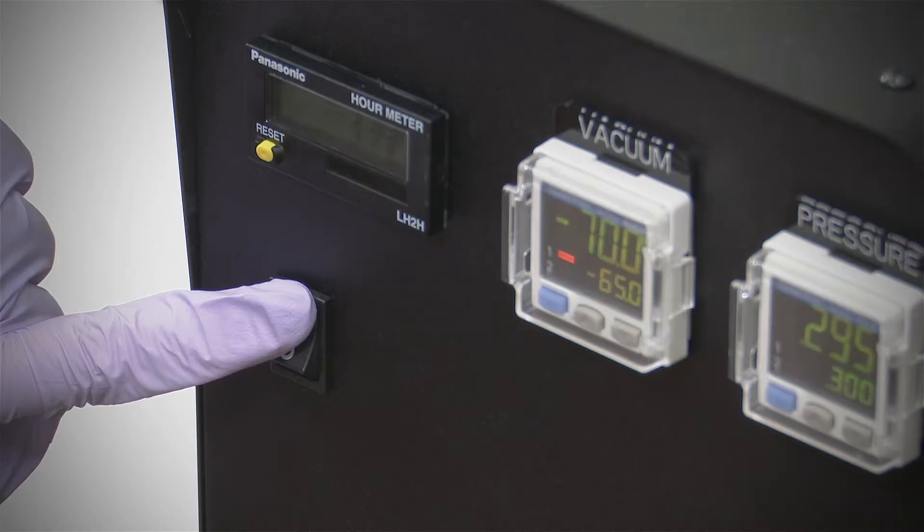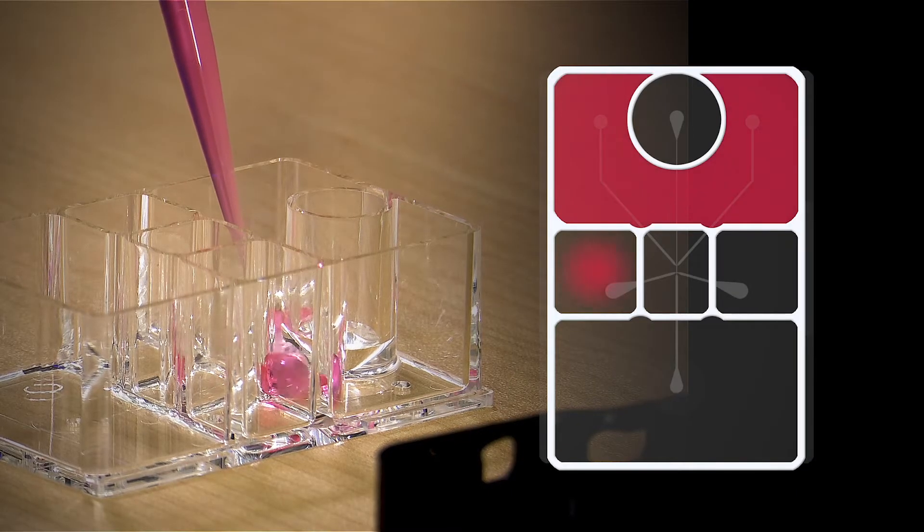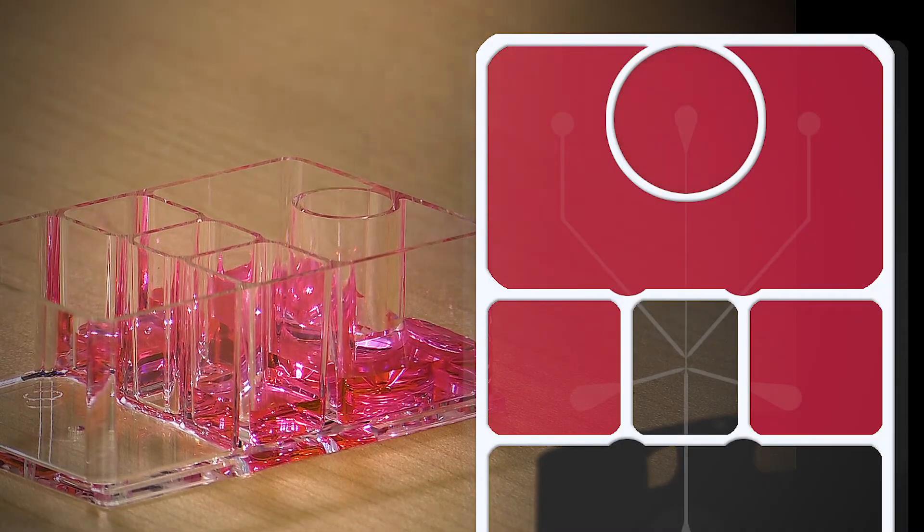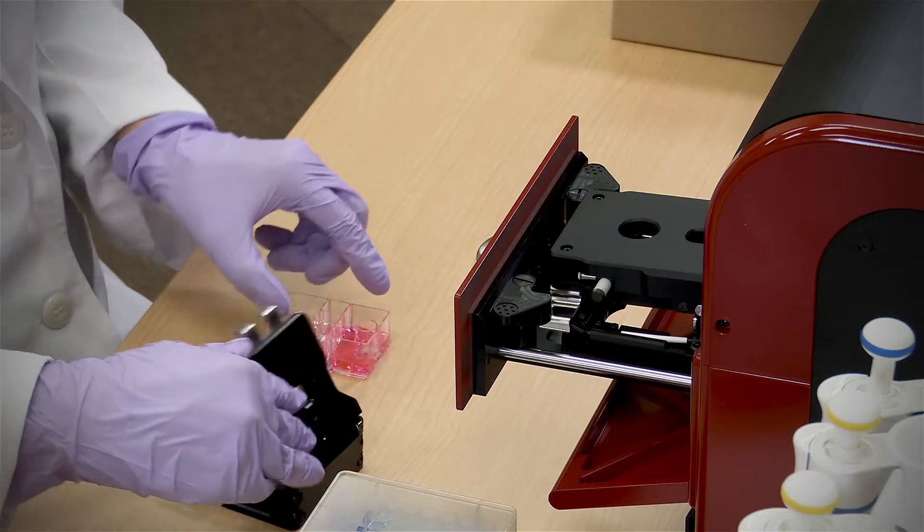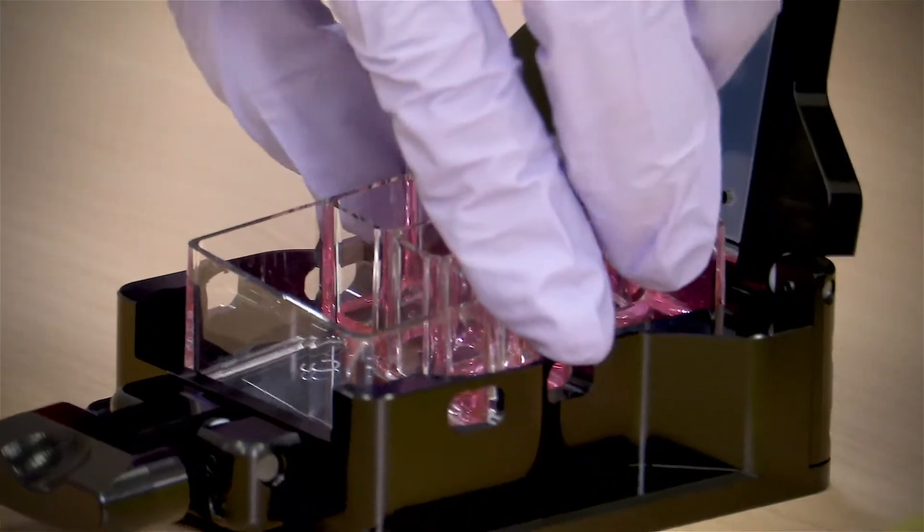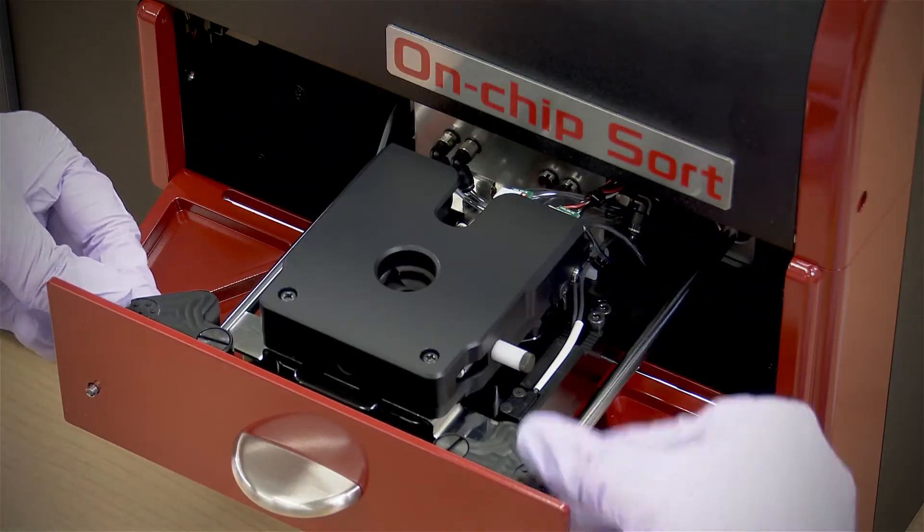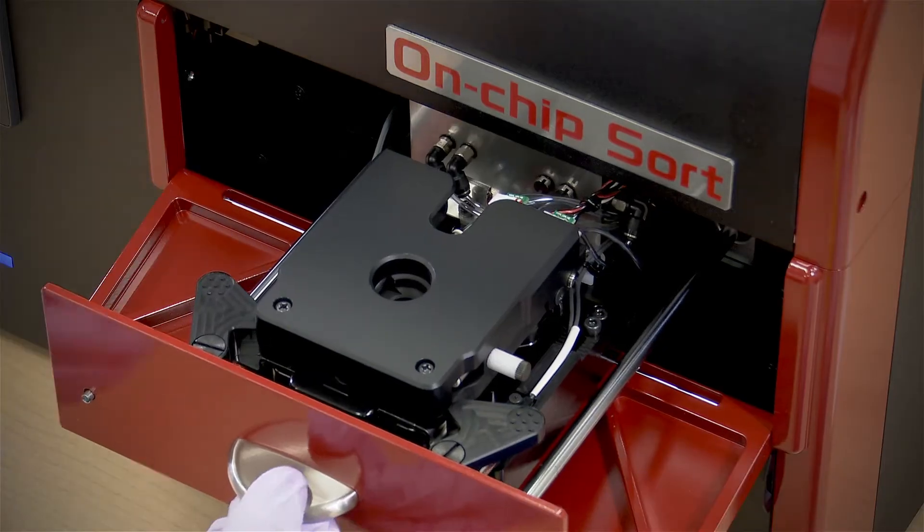Turn on the power. Load the sheath fluid and sample onto the chip. Samples can be sorted from a minimum of 20 microliters. The optics are auto-aligned after the chip is placed into the sorter.